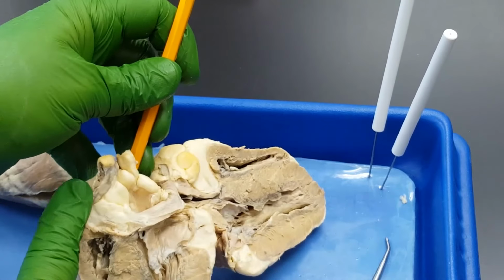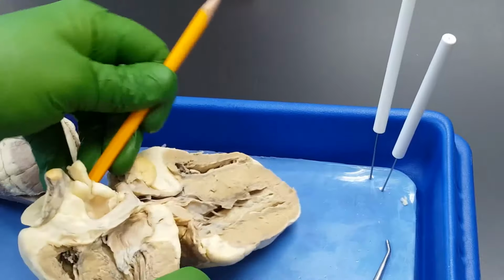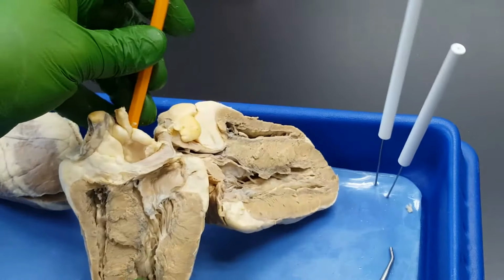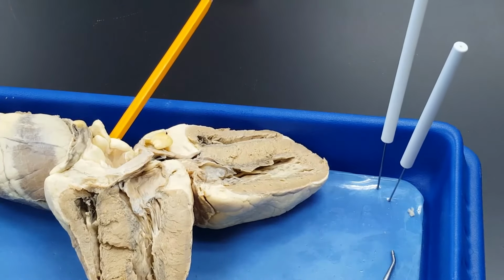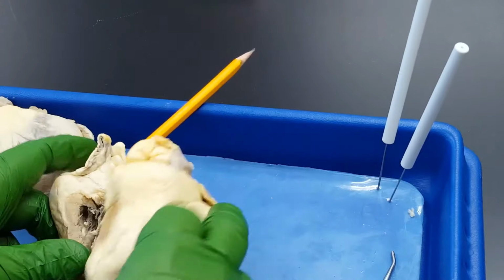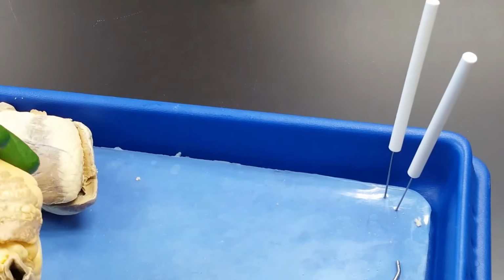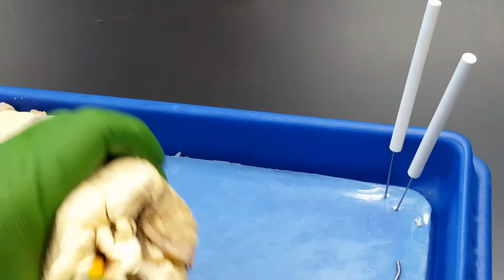Am I in the right or left atrium? This is the right atrium that I'm in, obviously. So that makes this one of the two vena cavas. But on the sheep heart dissection, these things are always cut so short, there's really just one vena cava.